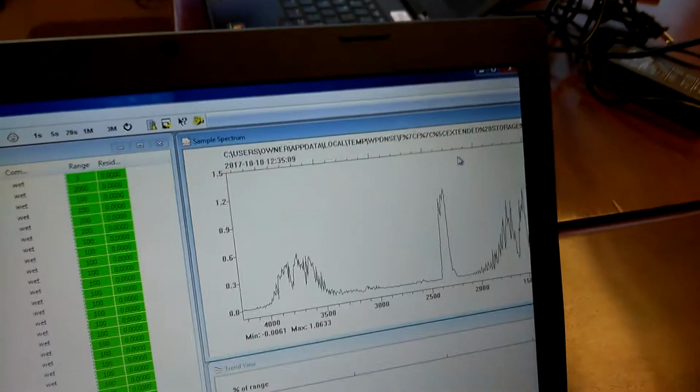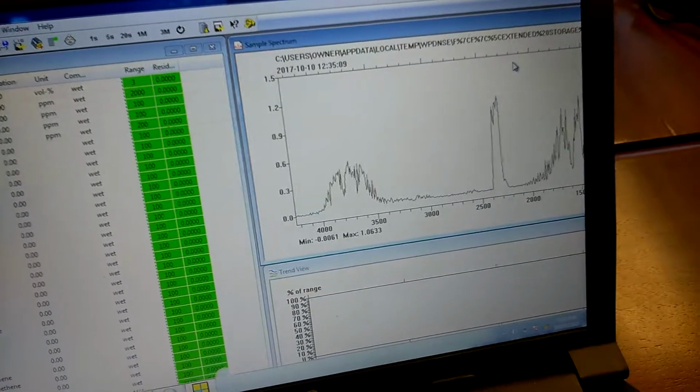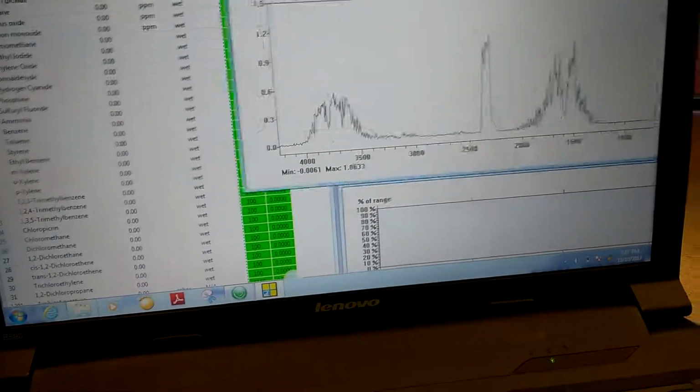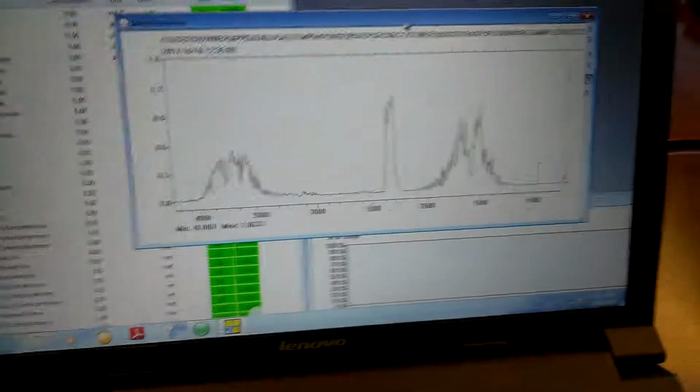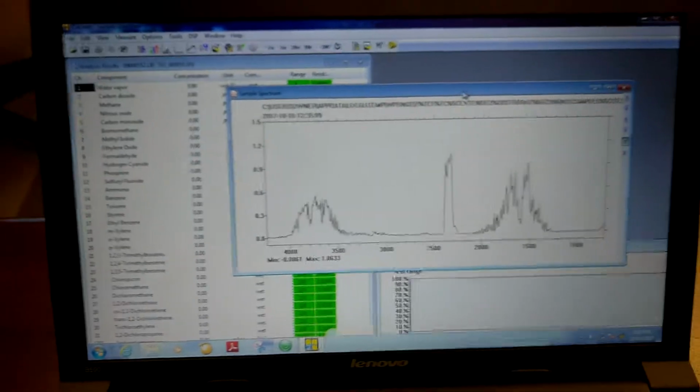The other thing is I'm not really sure how to export data out of here, and it doesn't seem to quite fit the resolution of the screen here. So I'm not sure how to get a good screen capture of it either, although I do know that these move around a little bit. So I'd probably just use the snipping tool or print screen functionality. That's not going to help me for my analysis results though, so I've got a few gaps.